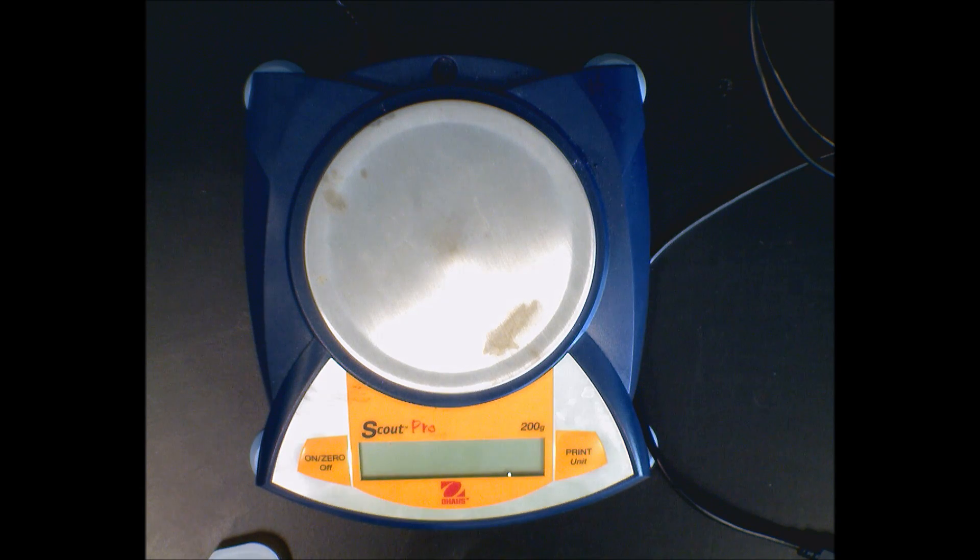So here today we're going to show how to use one of our electronic balances. You notice that we have a dark screen here. It says 'on', so we're going to push that. You must wait - this does have electronics in it. It's running through a little warm-up, a system setup, just like your computer would. When it says zero zero zero, you're ready to go.